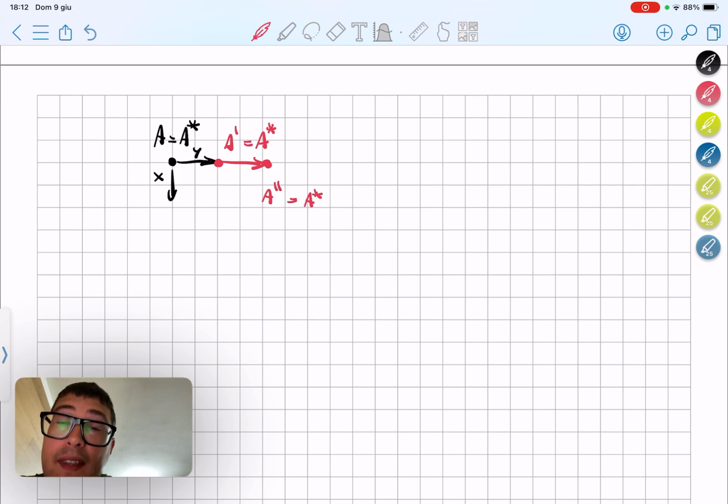And keeping track of this change of the position of the piezo in order to maintain the same amplitude that we fixed at the beginning is what is actually used to measure the topography of the surface.